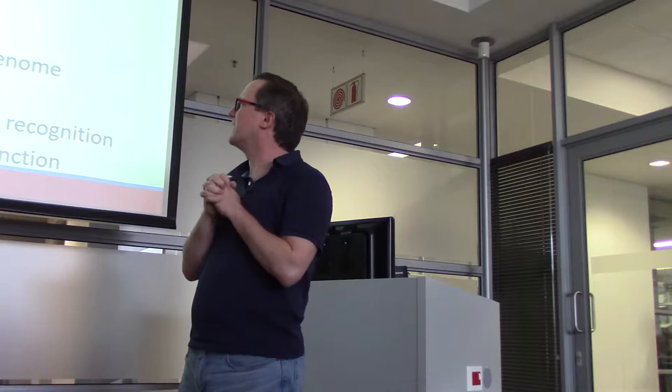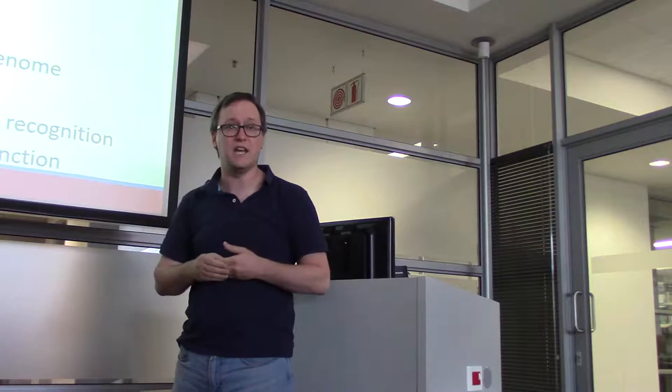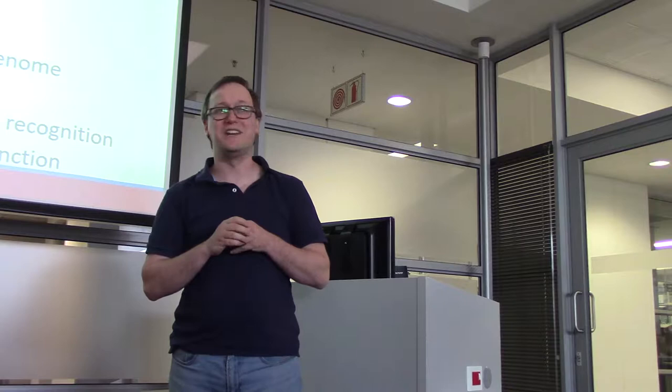It looks like kind of a complex overview, and it kind of is. So it splits into halves, as I said. The first part is, how do we get an assembly? So we're going to talk about paired end sequencing as this key technology that enables us to do good assemblies. We're going to talk about the problem of repeats or repetitive DNA. And then from there, we'll talk about k-mers. We're going to talk a little bit about algorithms and data structures. And I know that's going to be exciting for everyone, but it is before lunch, so I don't want to see any shut eyes, all right?